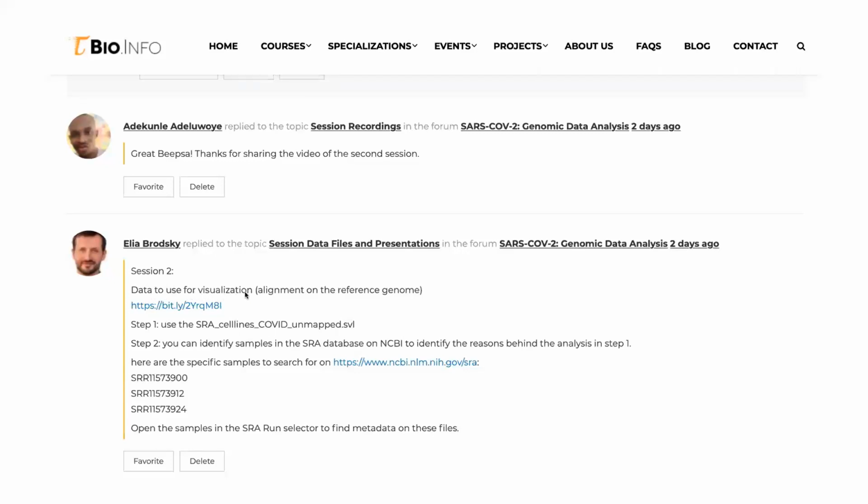So when we align the reads to the reference genome, we'll check whether any of you have been able to do that, and I'll show you how to do that again. And then also how to identify some of those reads and how to find exactly what you're asking there. How do we understand what kind of data this is?